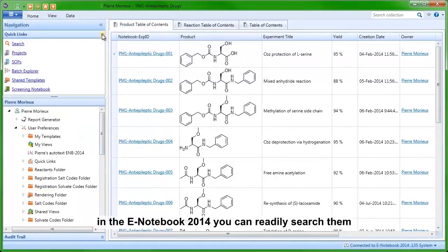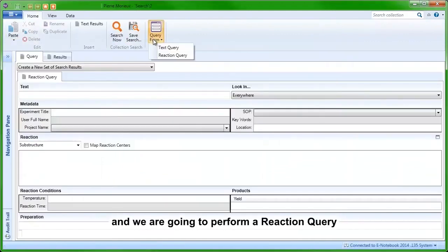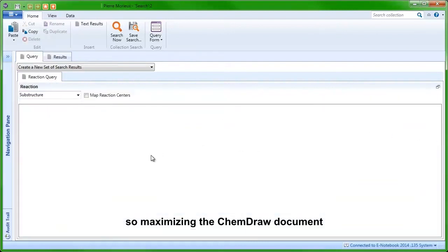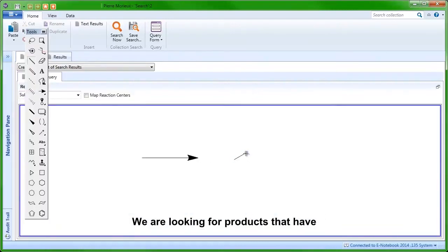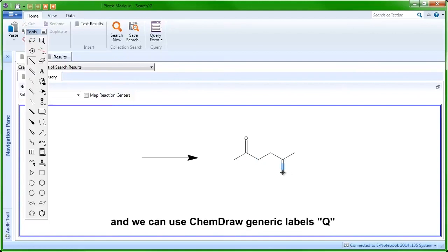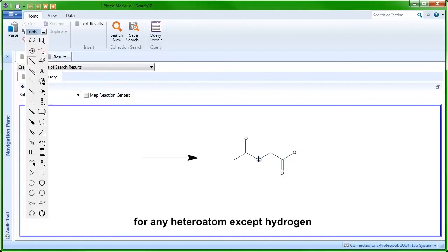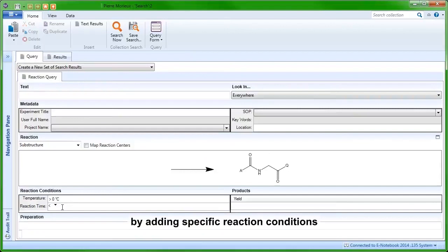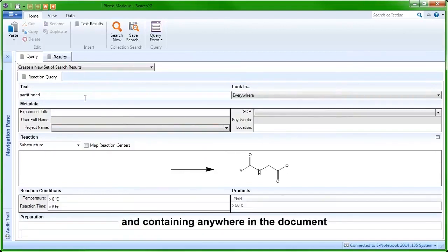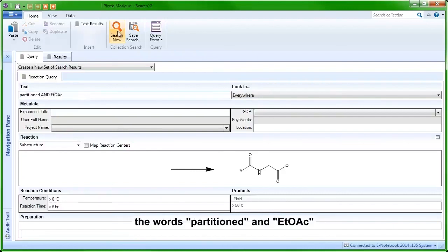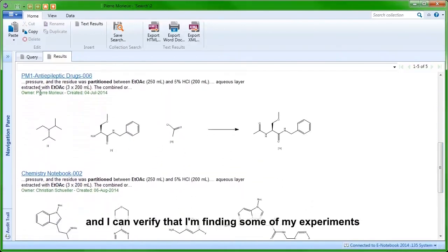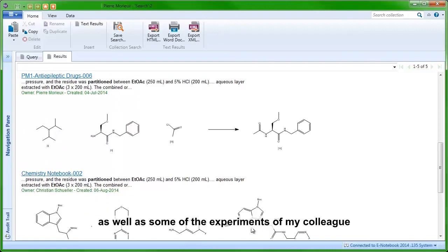Once you have many experiments in the notebook, you can readily search them. We are going to do a reaction query with a substructure search. Maximizing the ChemDraw document, we are looking for products that have an amino acid-like structure, using ChemDraw generic labels: Q for any heteroatom except hydrogen, and A for any atom except hydrogen. We can refine the query by adding specific reaction conditions such as reaction time, product yield, and containing anywhere in the document the words 'partitioned' and 'ethyl acetate'. After hitting search, I get a search hit list and can verify that I am finding some of my experiments as well as some of my colleague's.